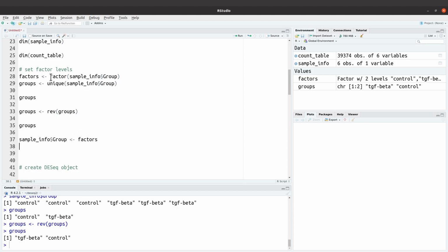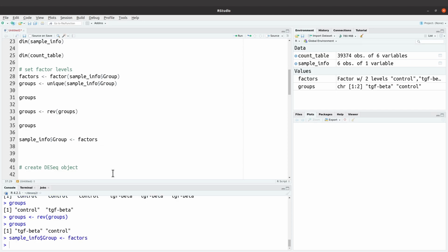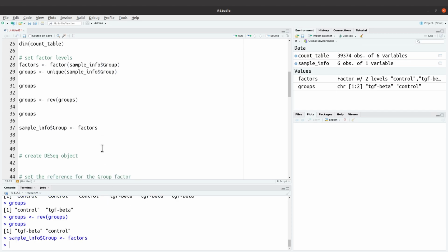Alternatively, we could have just brought this straight here. That's also another approach. So we don't need to type this code and then come and type again. We can just do it straight up. But I just want to keep it simple, step by step, so that beginners can understand whatever is going on. So that's why I'm doing it this way. Let's execute this command. All right, so now we have it done.